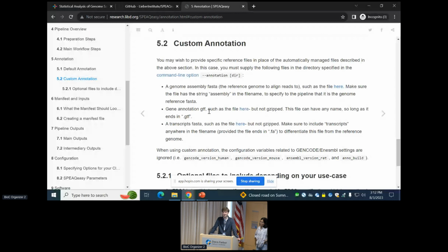Yeah, there are a lot of tiny subtle differences between IDs, so that's the question. Where I fall is that a lot of these nice tools are built for the bulk of what everybody does, right? Human or mouse, one or the other, and I rarely handle that data. I handle custom data of all sorts of different species, which is why I intimately know the details of a GTF file, how to put it together, how you figure out what's in there, and how to modify it. Yeah, I guess that is an area we haven't explicitly tested. And if there's an issue, we'd be happy to try to make that work.